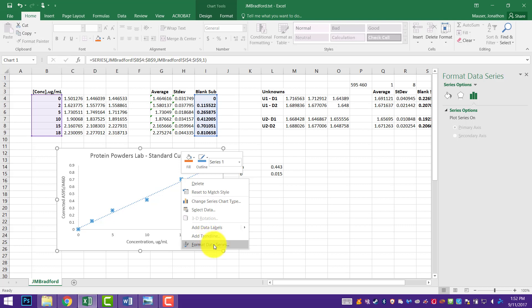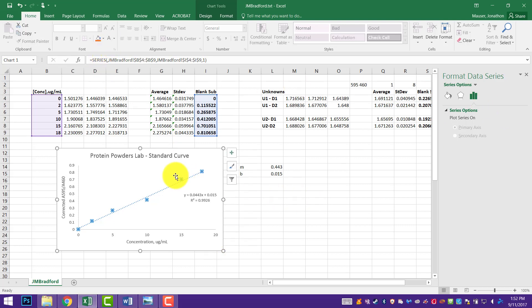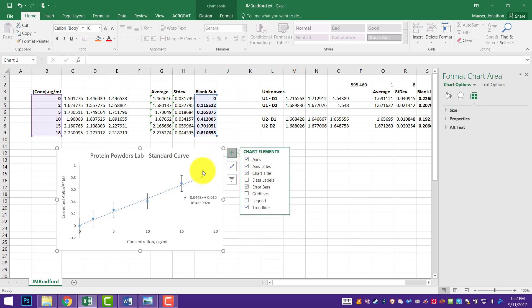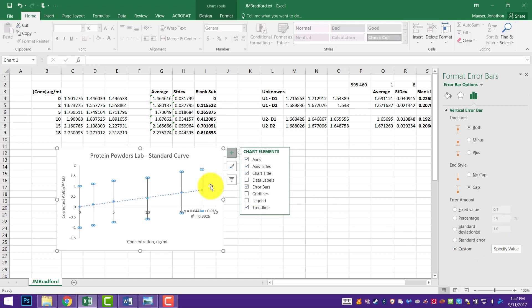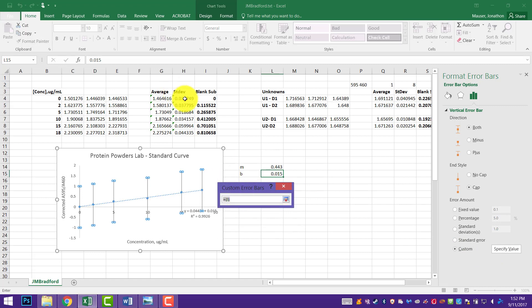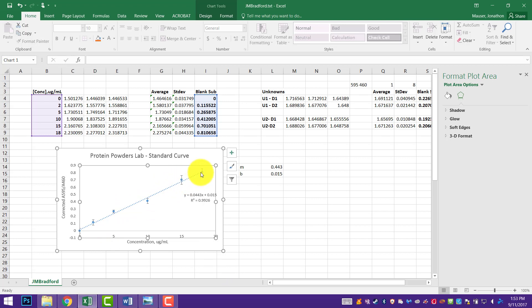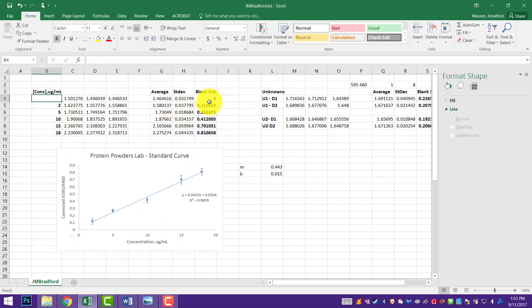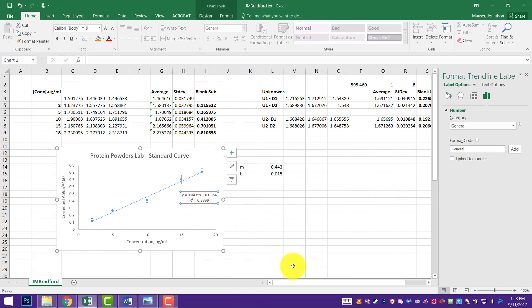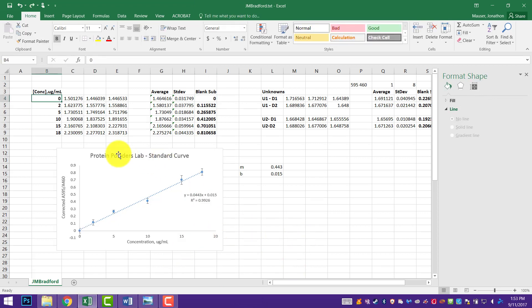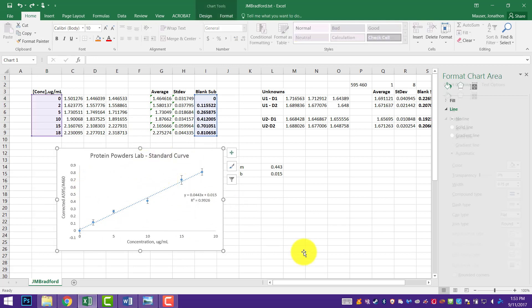I'm going to add error bars — get rid of the horizontals, then go to Custom error bars. I clicked on those, went to Format error bars, and I'm going down to Custom, Specify value. I'll select my standard deviations for the positive error bars, same selection for the negative error bars. You can see I have a little bit of deviation from well to well on some of these. Our R squared value actually went down a little bit when I removed the zero point — it's okay to include your zero, because that's a legitimate piece of data that you measured.